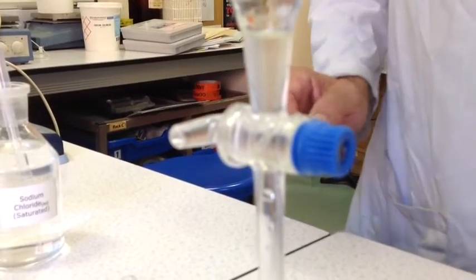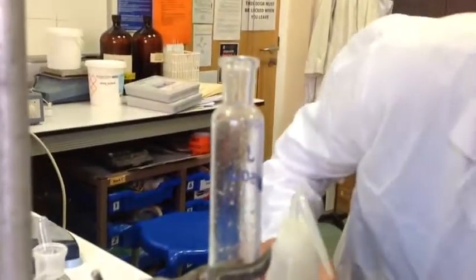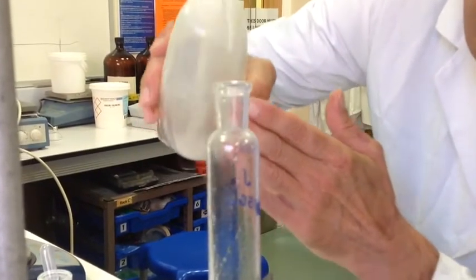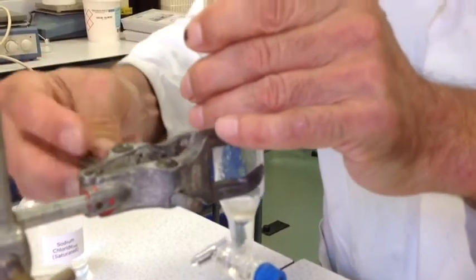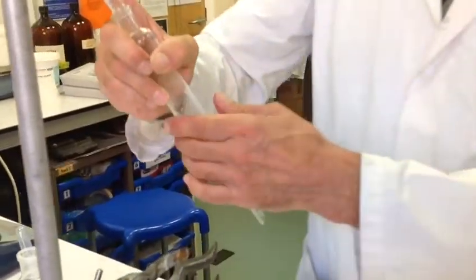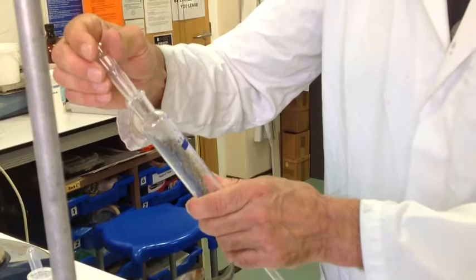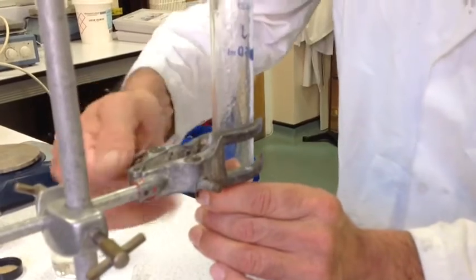Okay, we are then going to add an equal volume of water to the separating funnel, again approximate, in the top. Going to stopper the separating funnel, unclamp, going to again with your finger on the stopper shake for a few seconds, release any pressure in the separating funnel pointing away from you, and taking the stopper off and returning the separating funnel to the clamp.